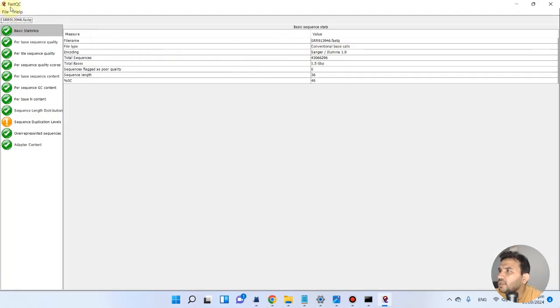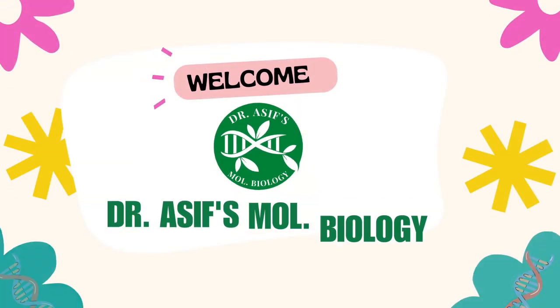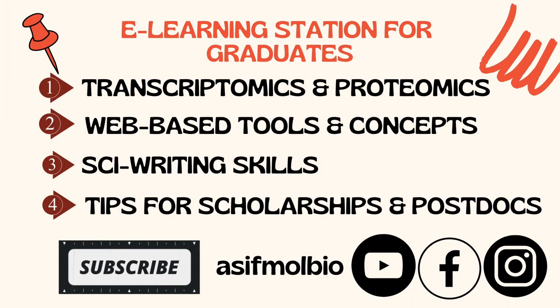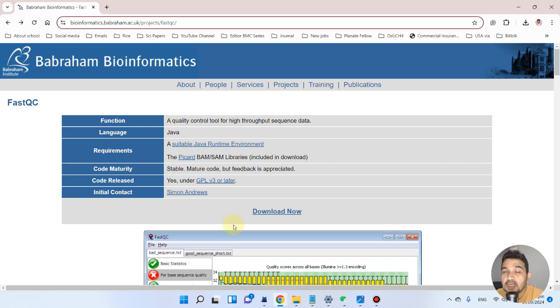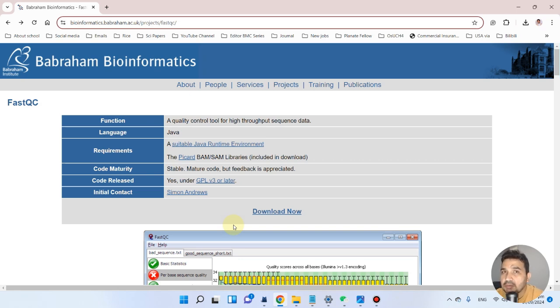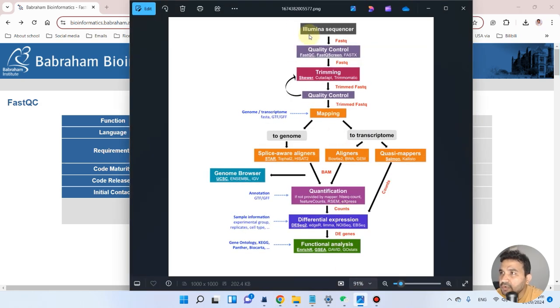Welcome to another video tutorial. In this video we will run FastQC on files which we have downloaded through our SRA tool. In the previous video we downloaded the SRA data using the SRA toolkit. If you don't know how to download SRA data in bulk using that tool, I recommend you go back and watch that first. Once we have our data, we will run FastQC quality checks on it.